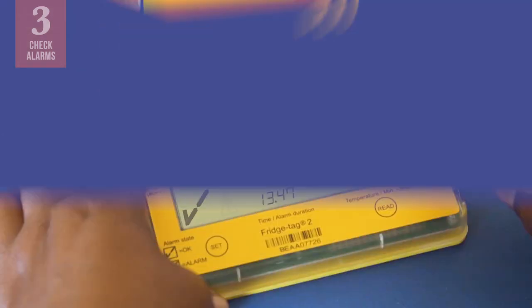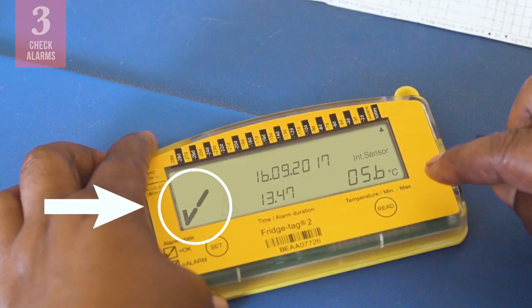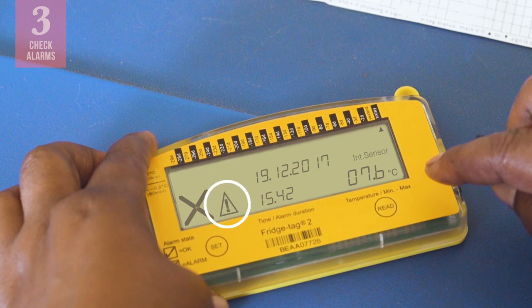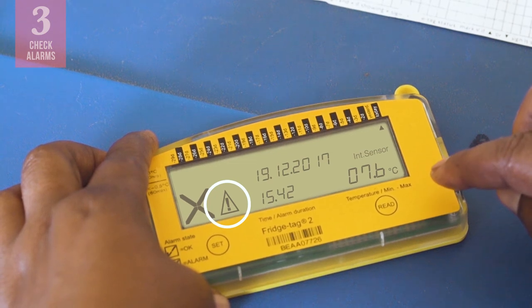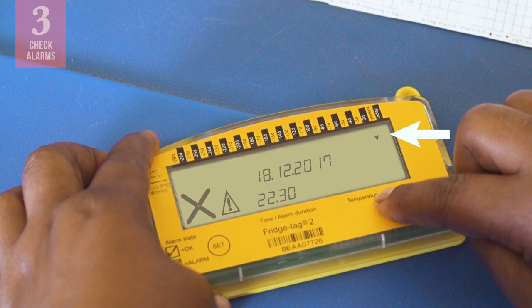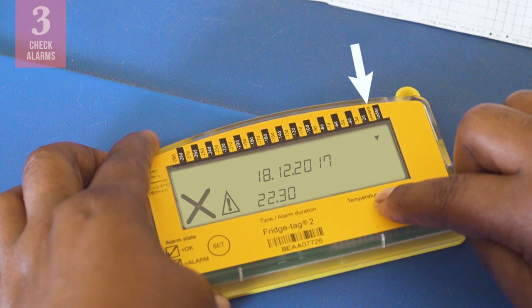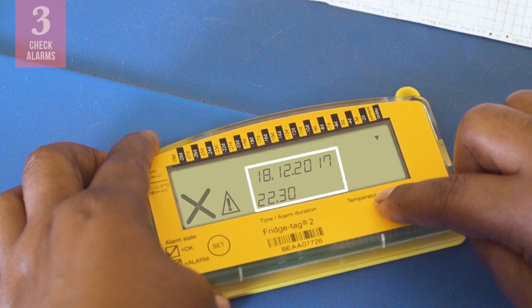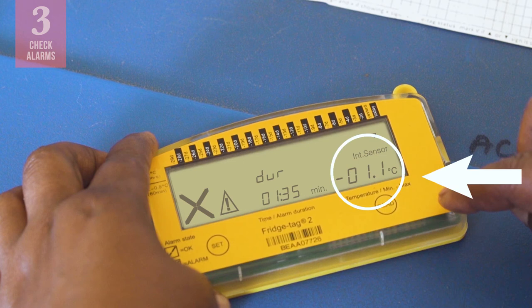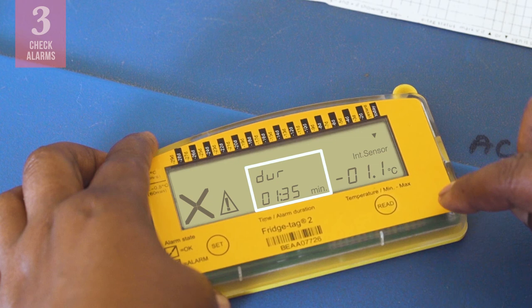To check for alarms, let us return to the main display. On the left, you will see a check or an X to indicate whether an alarm has been triggered recently. A check means everything is okay. If you see an X on screen, you may also see a warning symbol beside it, and the first thing you should do is find out more about this alarm. Press the Read button to find out whether this is a heat or freeze alarm. An arrow at the top of the display screen will be pointing up to indicate a heat alarm or pointing down to indicate a freeze alarm. The arrow is positioned to show you which day the alarm occurred on, and the date and time of the alarm will appear in the center of your screen. Press the Read button again to see more details about this alarm, such as the lowest or highest temperature recorded during the alarm and the amount of time the temperatures were outside of the acceptable temperature range.